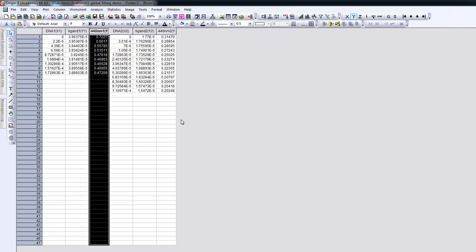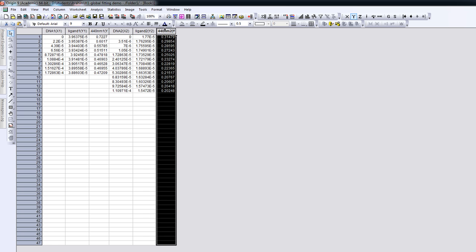Hello. We are going to carry out a global data fit of basic data for two titrations. The data has already been entered in Origin. What we see here is a series of DNA concentrations, a series of ligand concentrations, and a series of absorbances at 440 nanometers for the first titration and for the second titration. These concentrations have been calculated previously using Excel.